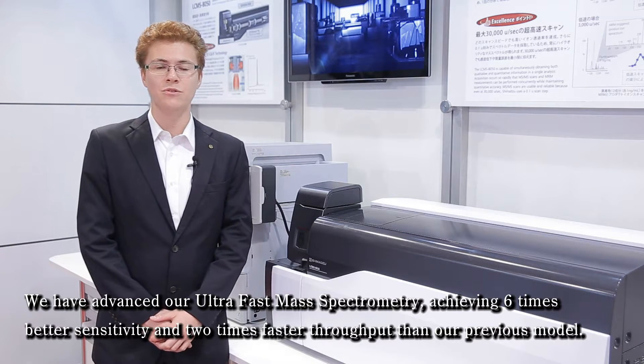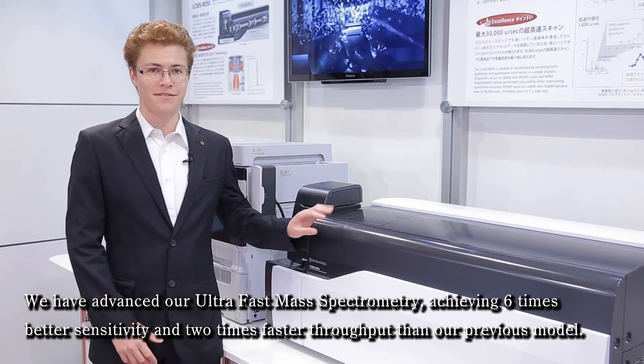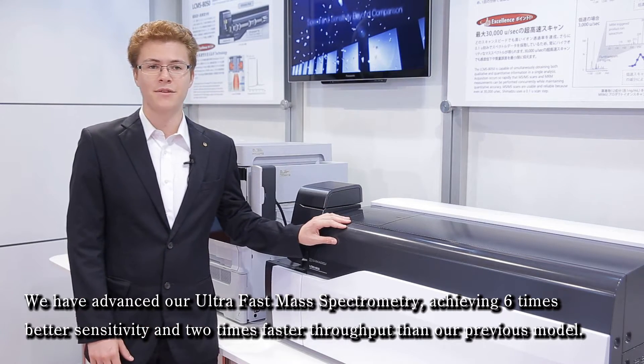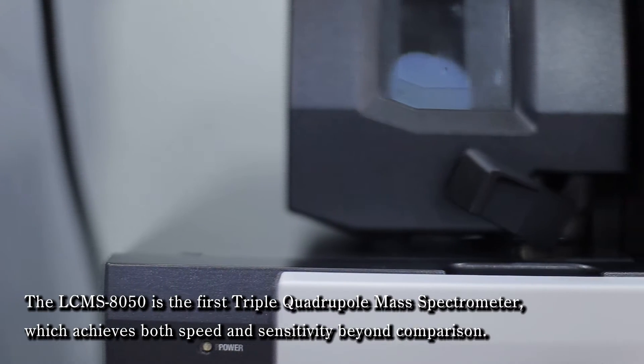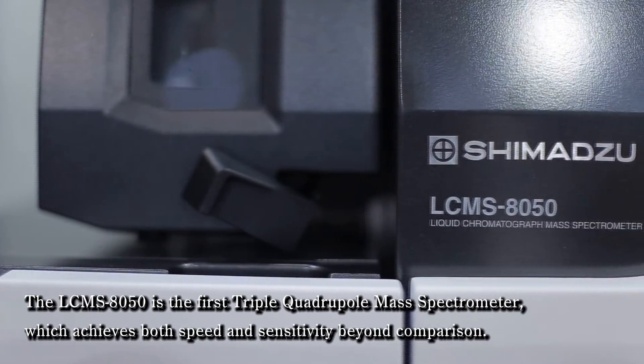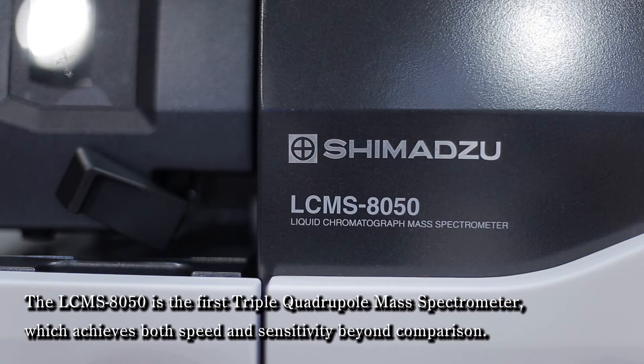We have advanced our ultra-fast mass spectrometry, achieving six times better sensitivity and two times faster throughput than our previous model. The LC-MS 8050 is the first triple quadrupole mass spectrometer which achieves both speed and sensitivity beyond comparison.